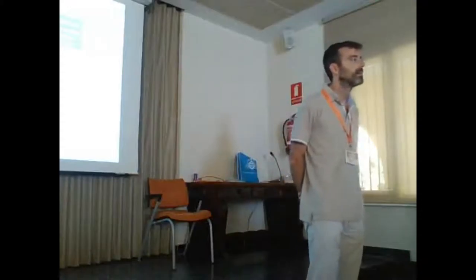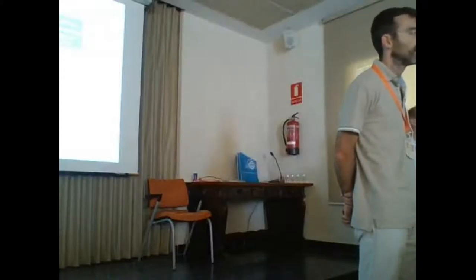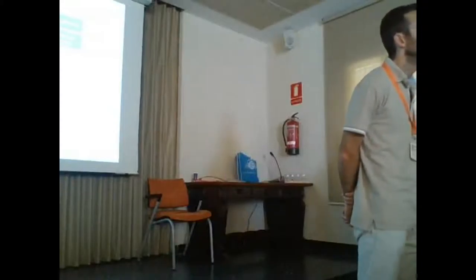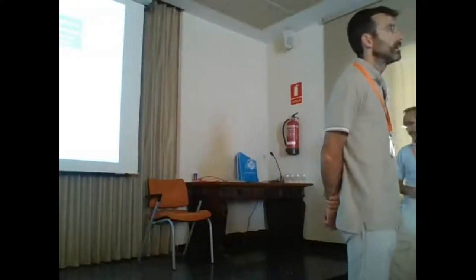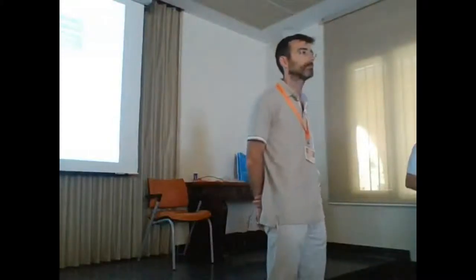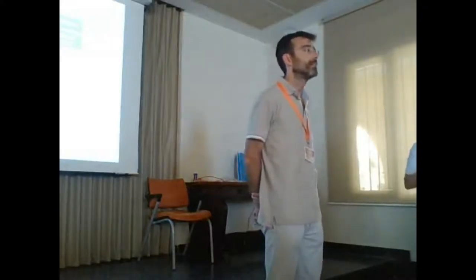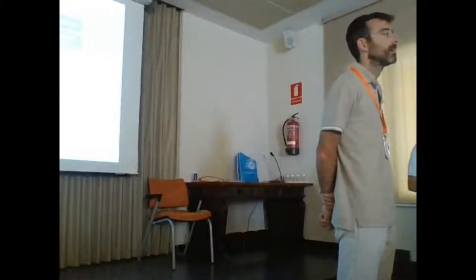In your studies on gallium sulfide, have you used single crystal X-ray diffraction? Did you observe the phase transformation to the cubic high pressure phase? Not with gallium sulfide, no. We didn't arrive at such high pressures in this experiment. We have some work on indium selenide. The problem, as far as I understood from the experimental data, is that people couldn't refine the structure of this high pressure phase.